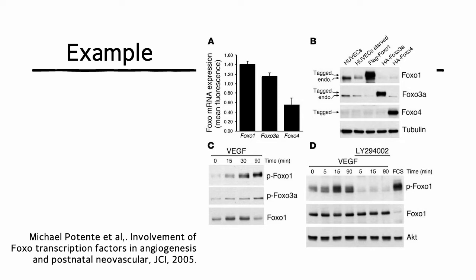And sometimes we overexpress those proteins, and in a lot of cases we overexpress some proteins tagged with flag or HA in the cells.